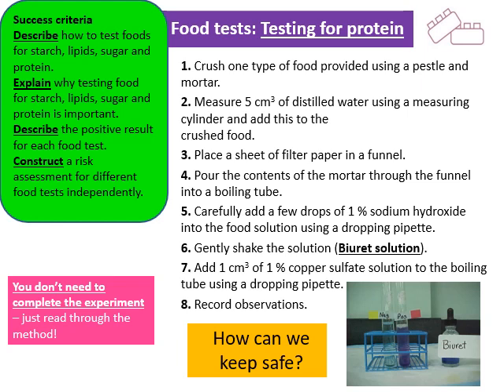Again, I've seen sodium hydroxide, which is another different chemical. So we need to be making sure that if it is harmful, we know what the risk is, and then make sure that we are thinking about how we can minimize this risk.